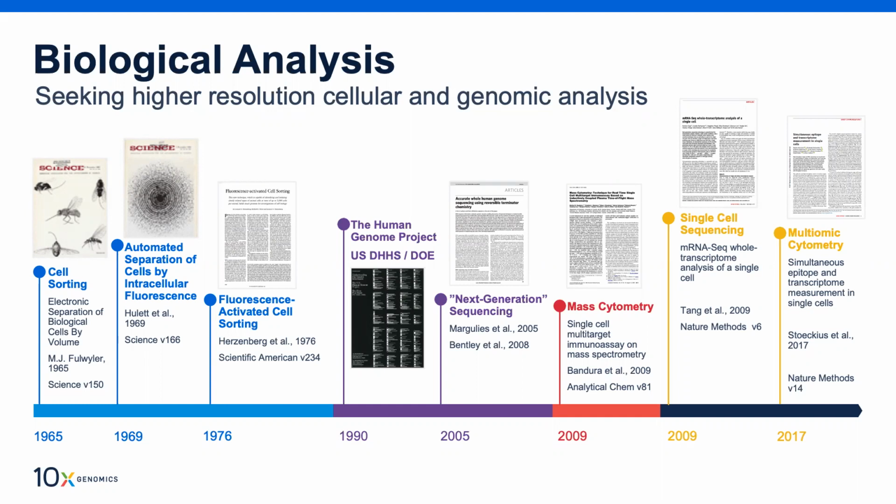For example, in the 1970s, FACS-based sorting became available. And this was a very powerful tool for immunologists to understand the individuality of those immune cells, but with a limitation that you were just able to do 12 to probably now 30 markers or 30 parameters. And then for the next 30 years, there was some incremental improvement till mass cytometry came in, where now you could use antibodies that are tethered to heavy metals. So you could expand that multiplexing ability now to possibly 100 different parameters.